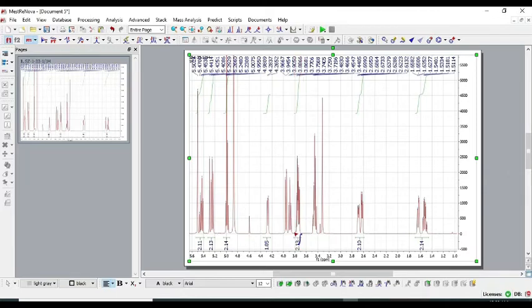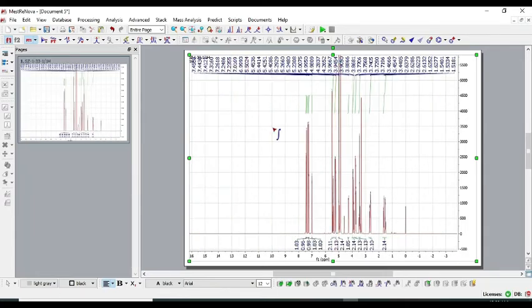This bunch shows 2 protons. This should also show 2 protons, yes. And this one should also show 2 protons. Yes, this is the methanol. You don't need to integrate it. So when I click on the full spectrum, you see that every peak is marked now with its integrals. So you sum up the integrals, you will get the total number of protons, right?